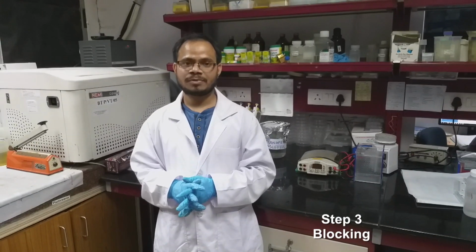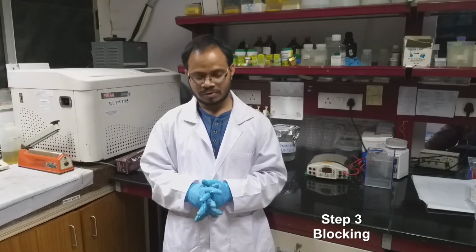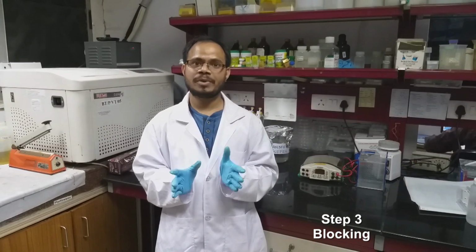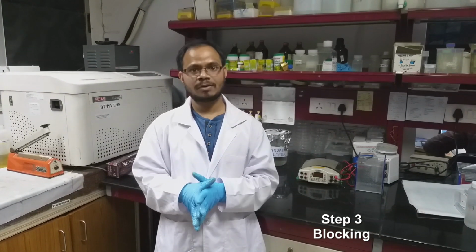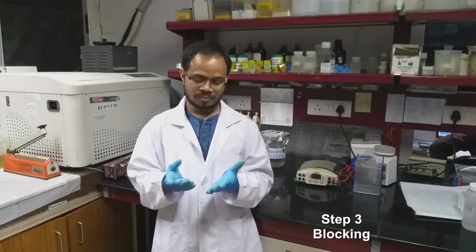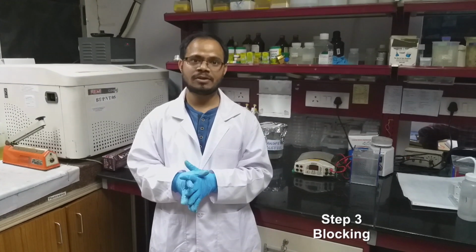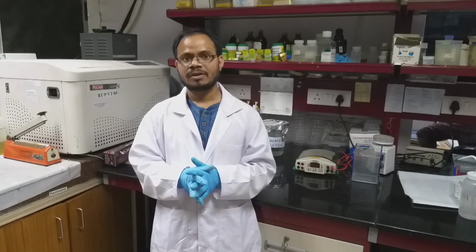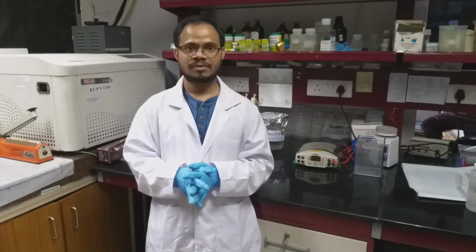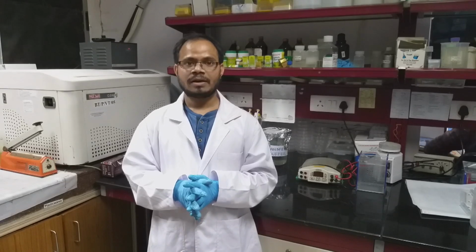The Western blot transfer all depends on how precisely you are doing the transfer. For example, you should not use your bare hands while handling the blot or gel. Whatever proteins are present on your fingers will be transferred onto the gel or membrane, which will give high background during development of the blot. So always use gloves.